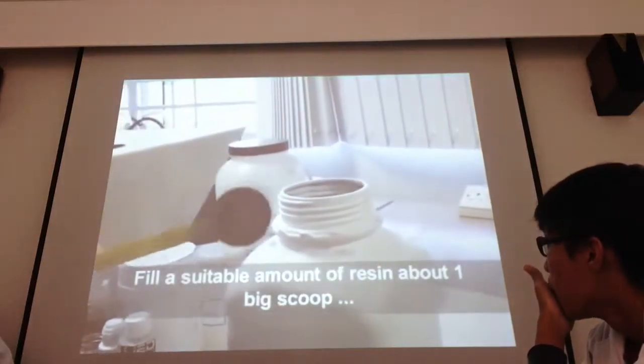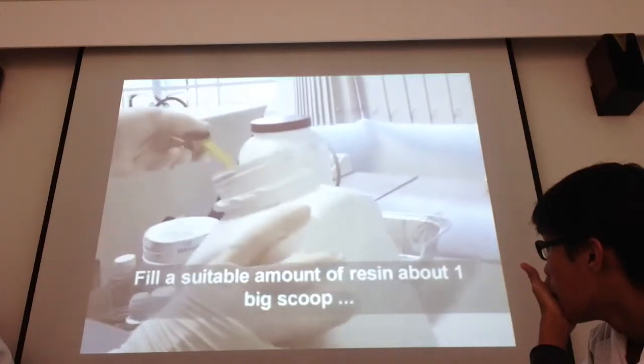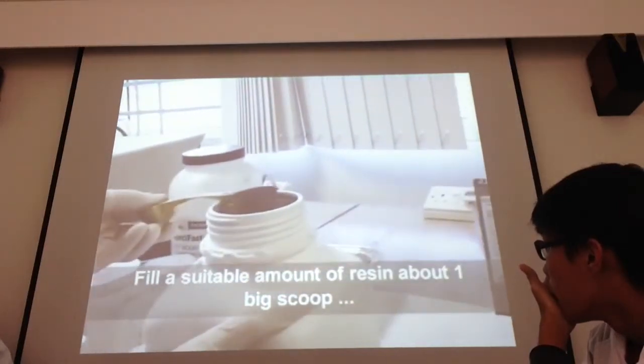Just take one full scoop per person, one level scoop.